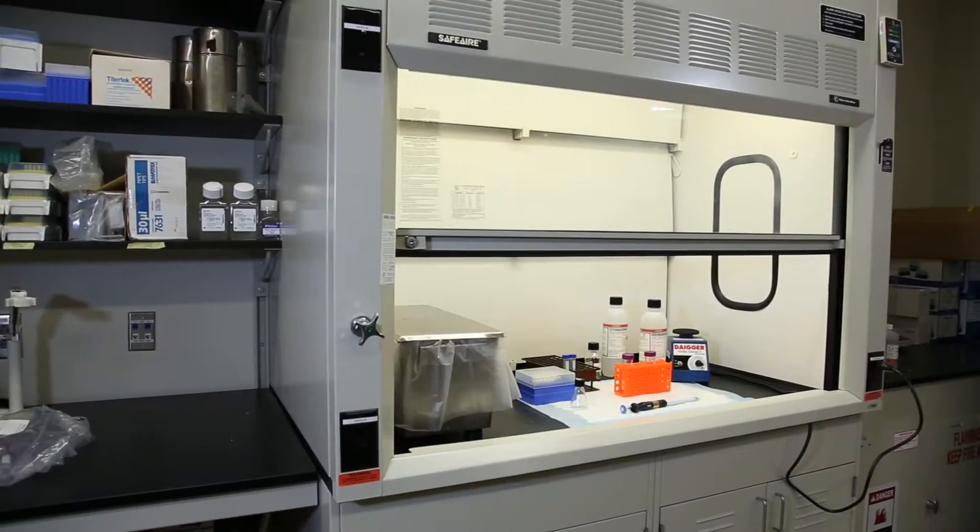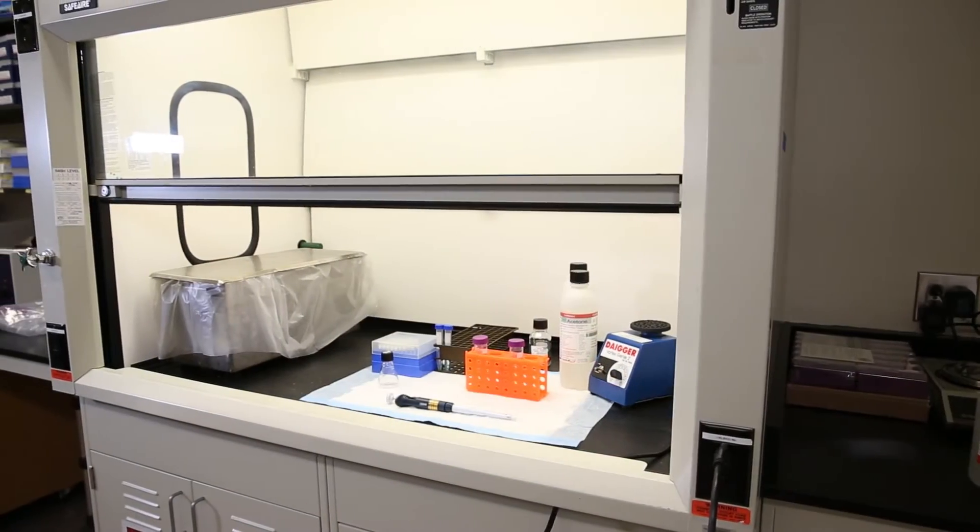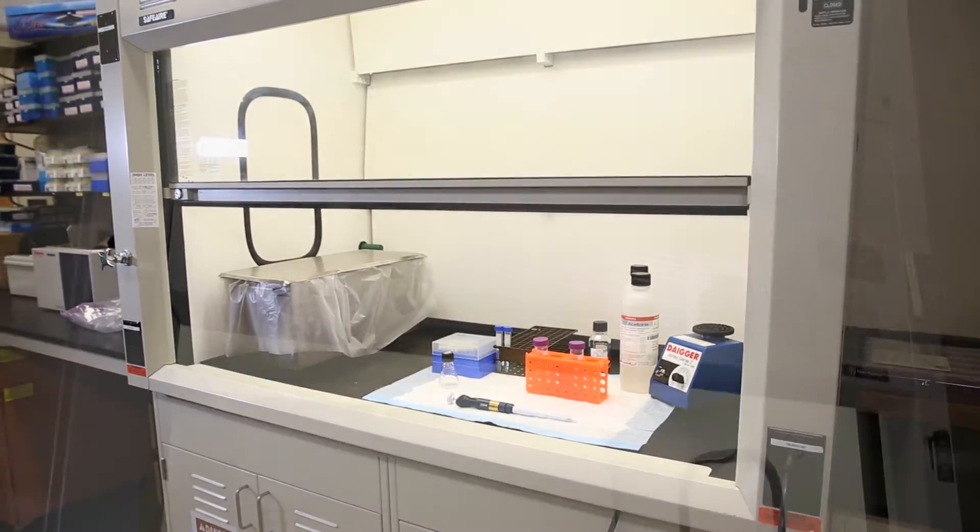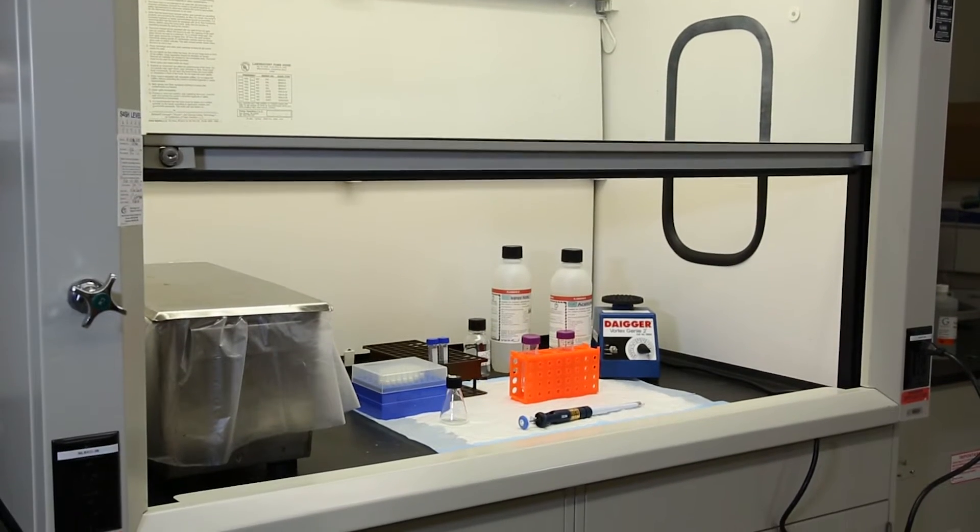There are several types of chemical fume hoods that provide protection and help capture and exhaust chemical vapors in airborne particulates. However, all types work on similar principles.